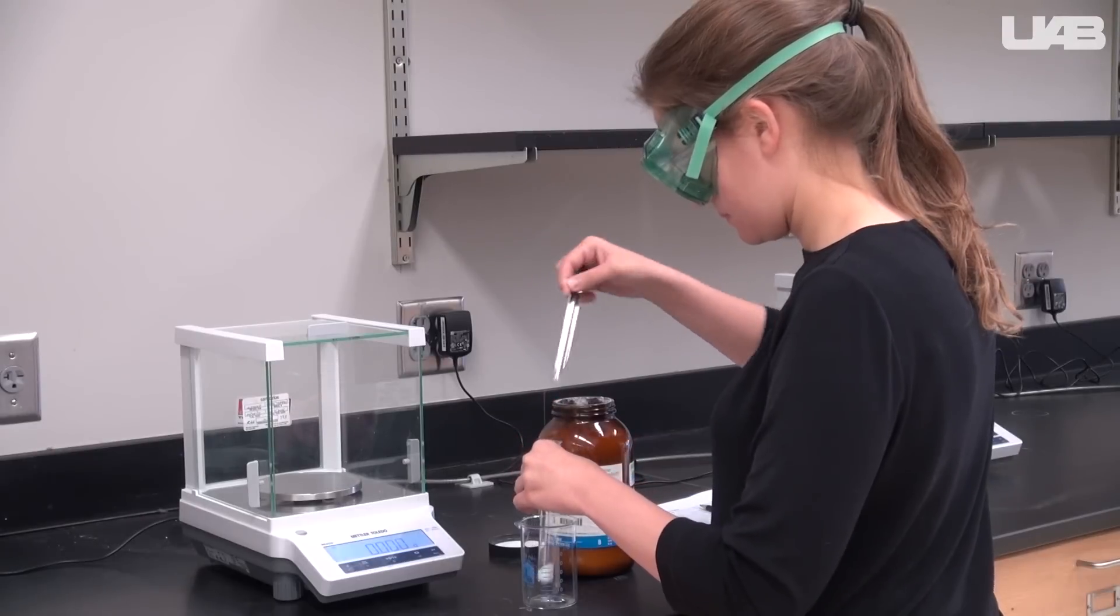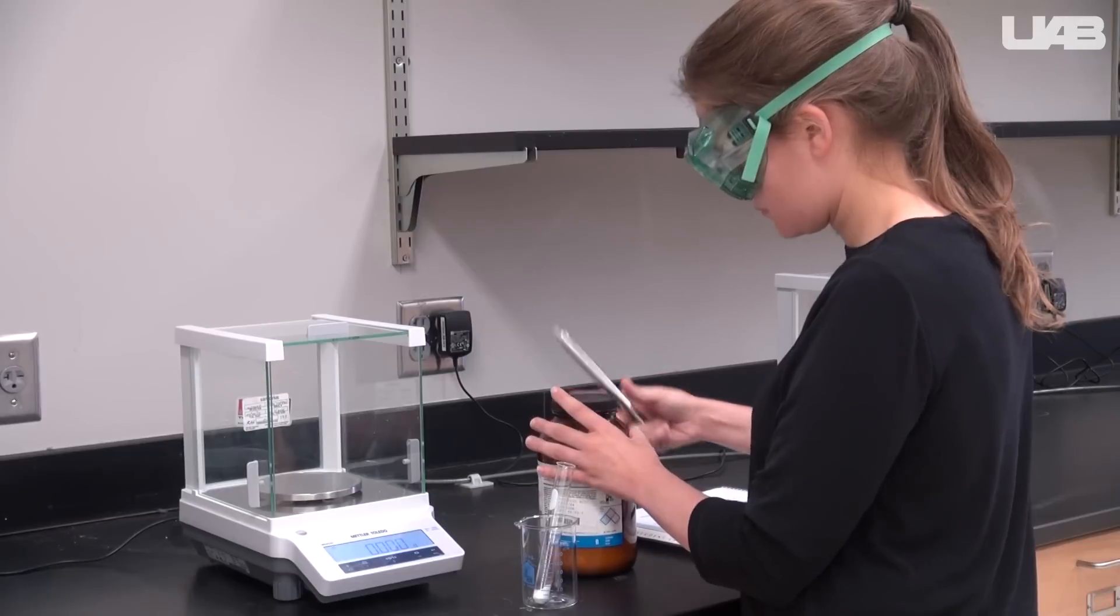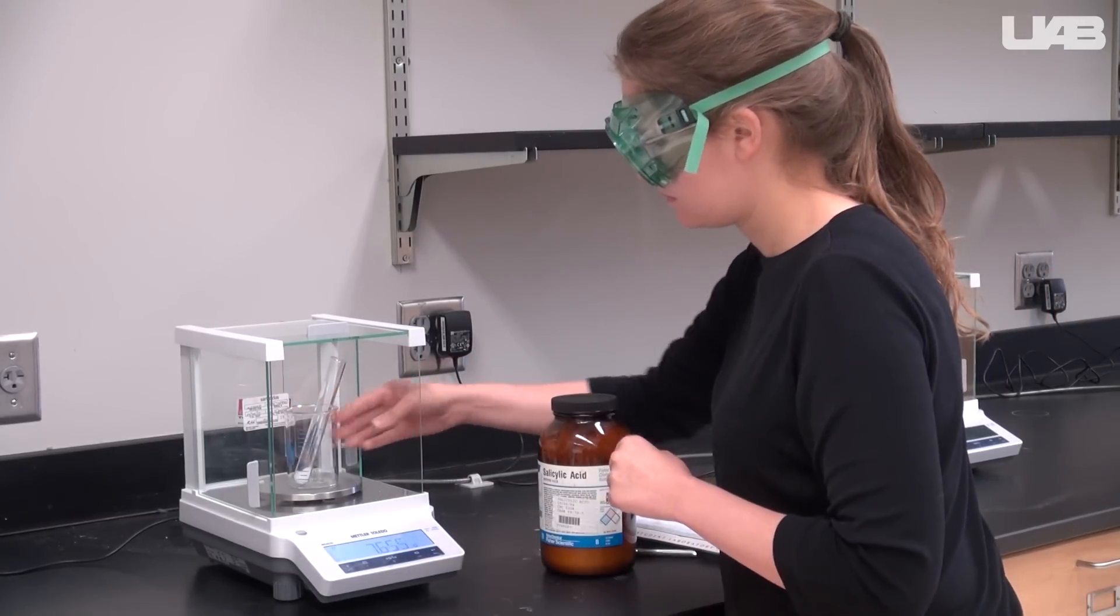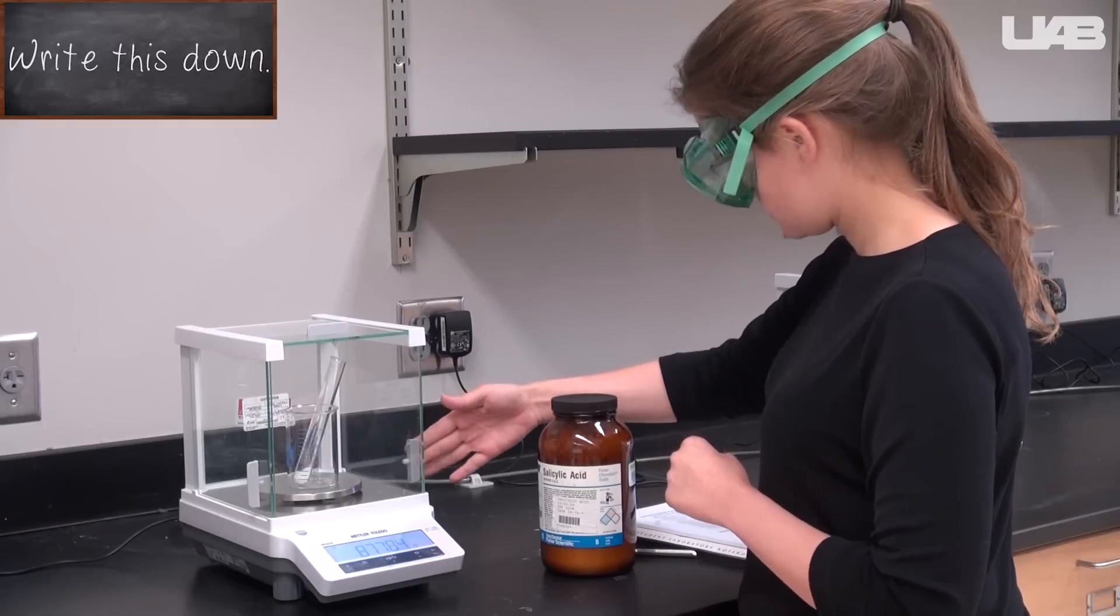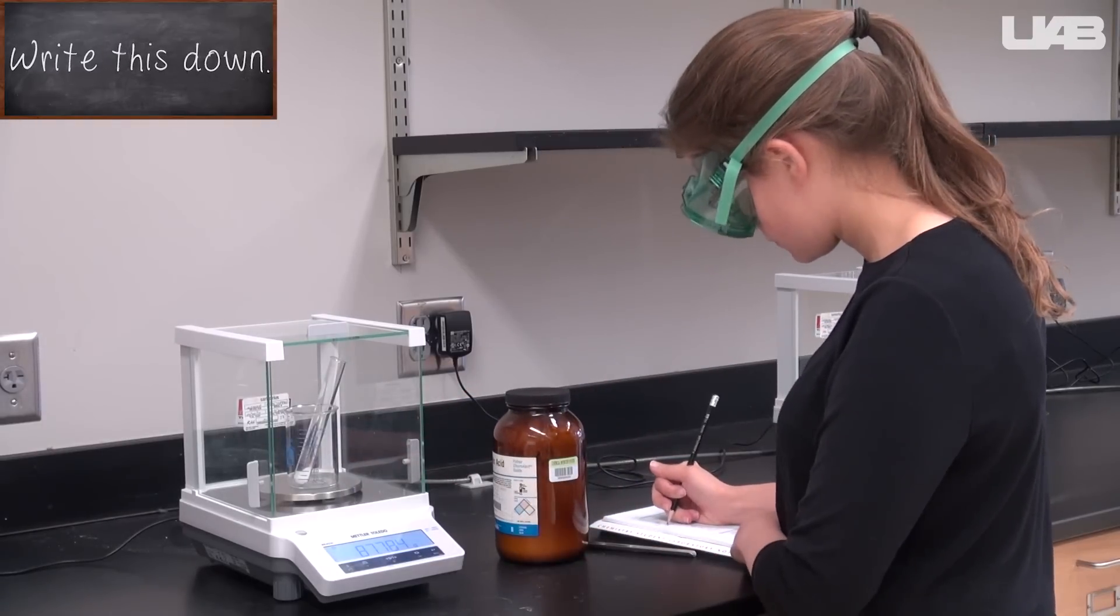The first thing you should do is weigh out about a gram of salicylic acid. You can place the test tube in a beaker to hold it upright, just to make sure that you account for the extra mass. It's okay if it's not exactly a gram. Record the mass in your notebook.